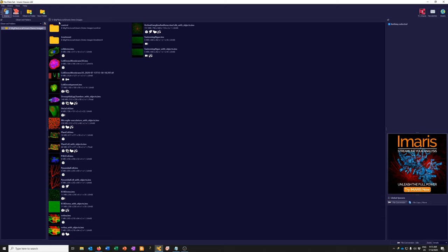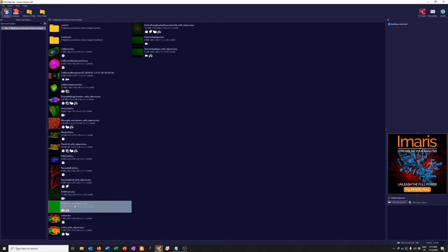When you open Imaris, it typically opens in Arena mode. There is also the Surpass mode, which is what allows you to actually view your data in detail. Arena is more like a fancy file explorer. When you install Imaris Viewer, it comes with a bunch of demo data, and that demo data is shown here — this is just a particular folder where the demo data lives on my computer. You can see there are some subfolders and some data sets.